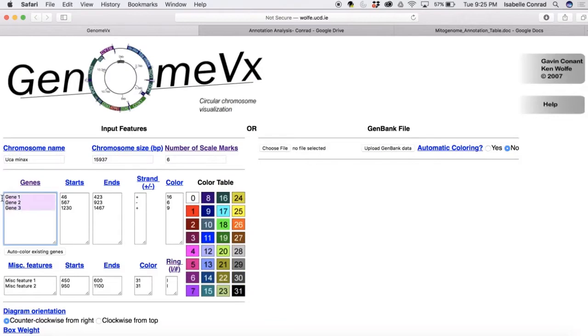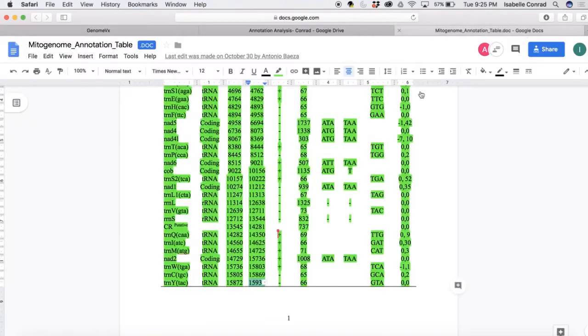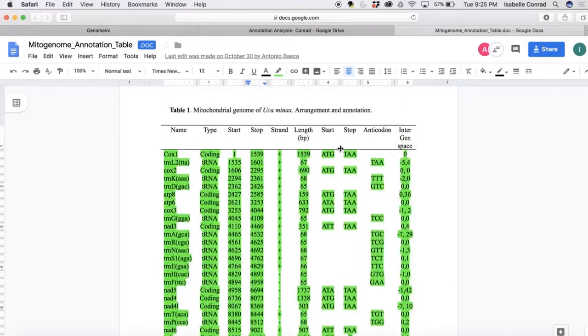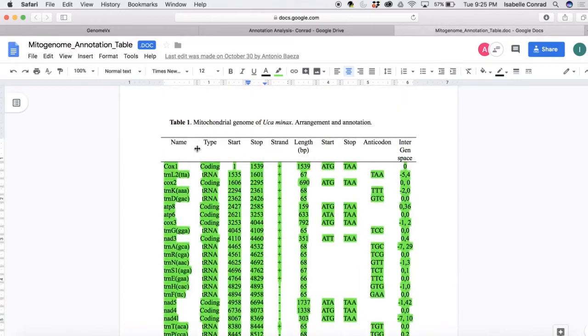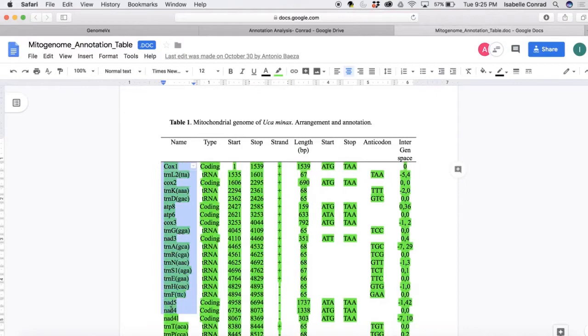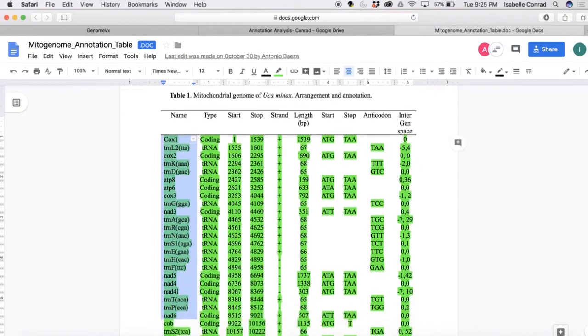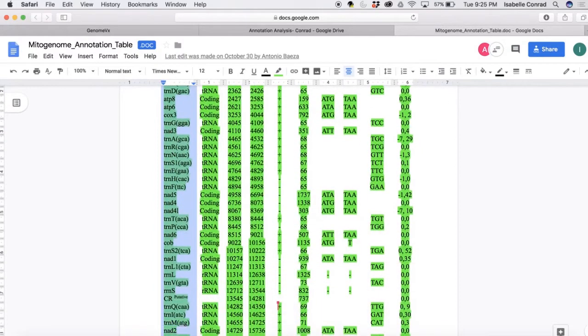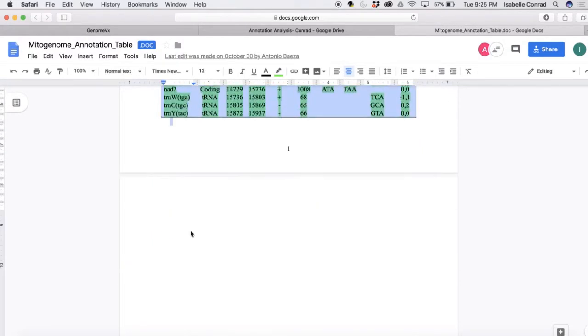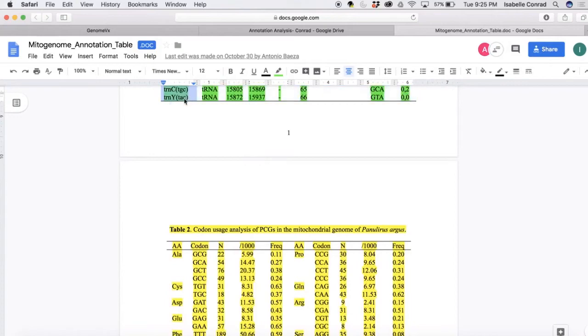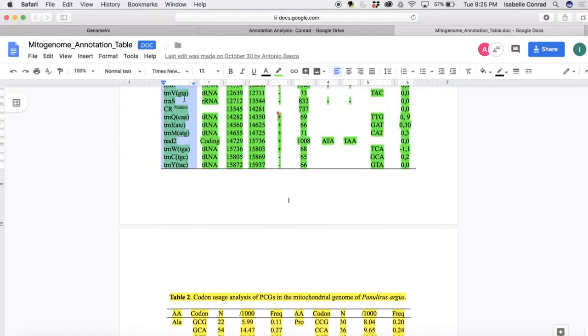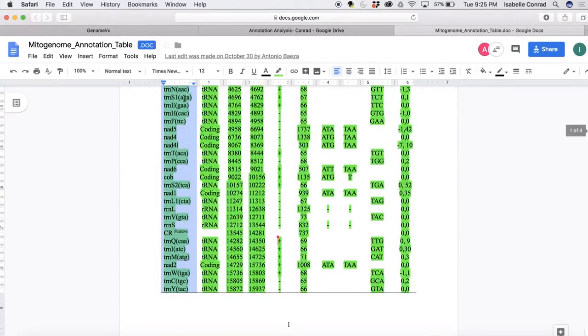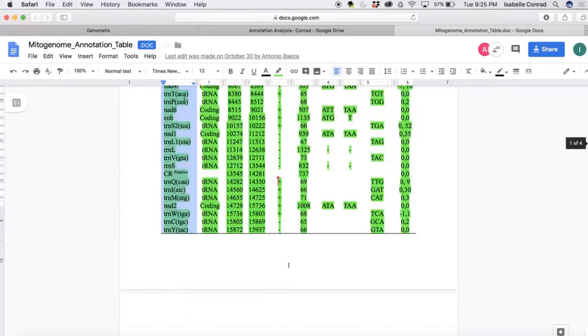So now we're going to enter in the gene names into the gene column. You're going to take the gene name column on your annotation table and copy that into the visualization tool.